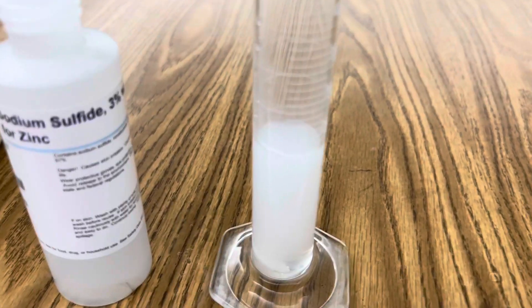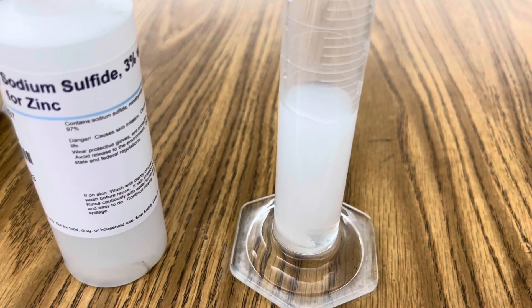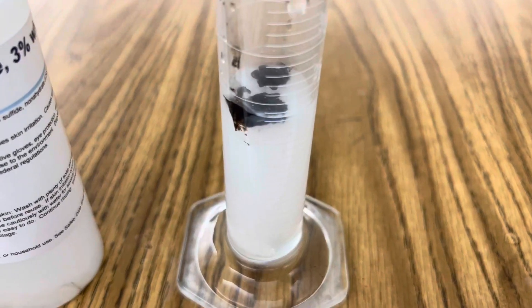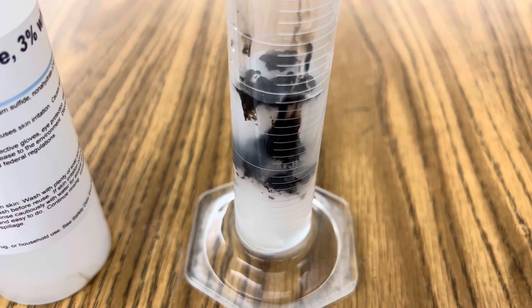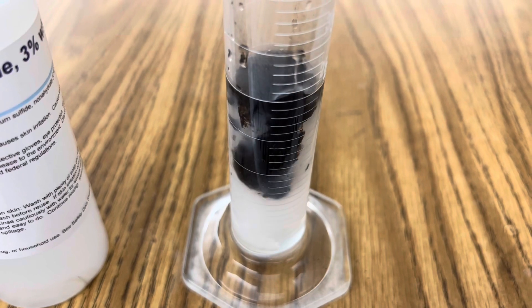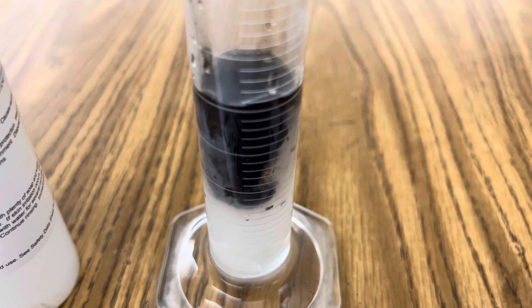Now we're going to try the same sodium sulfide in our lead nitrate solution in our graduated cylinder. You can see it immediately forming the precipitant of lead sulfide. Just amazing.